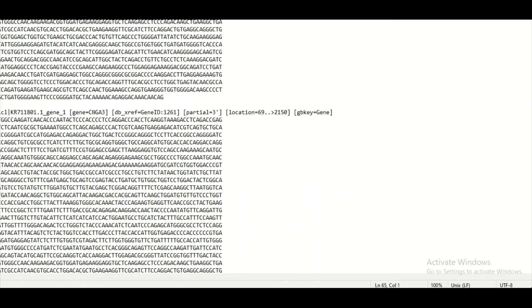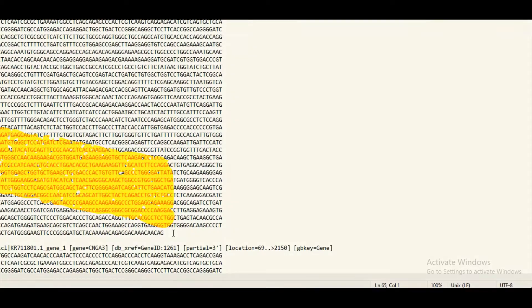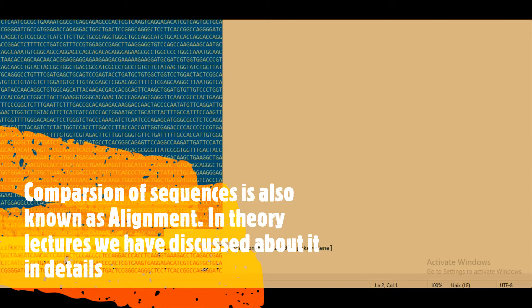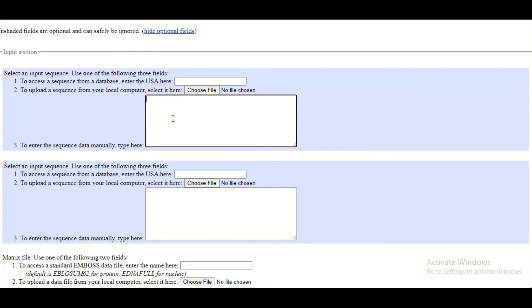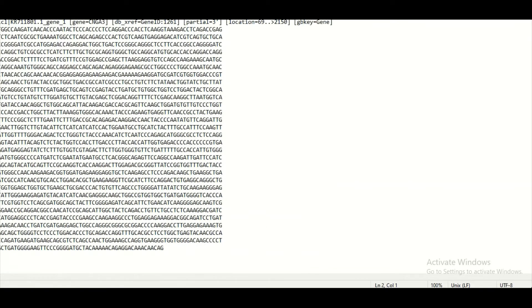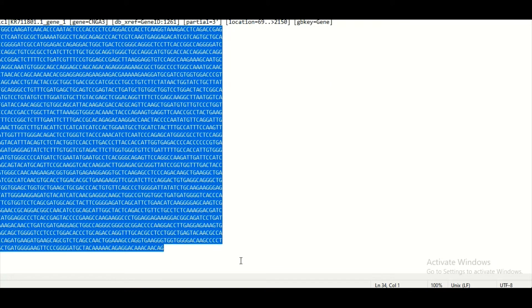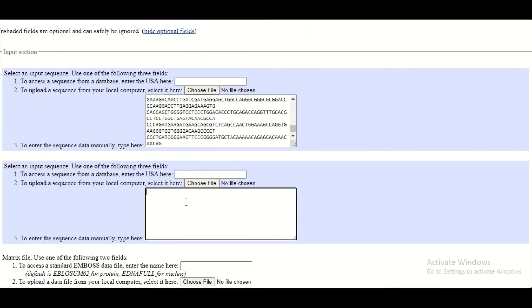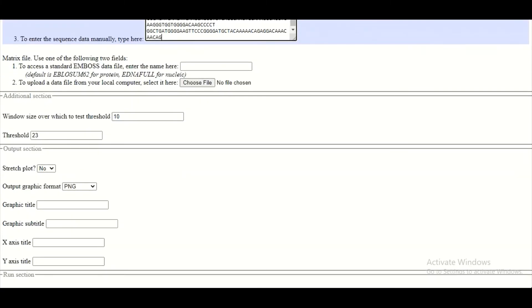Let's assume that these are the two sequences which we want to compare with one another, or in technical words, we want to align with one another. So what we will do is copy this first sequence and paste it here in this box, and the same thing we are going to do for the second sequence — we will copy it and paste it into the box, then we will fill up the rest of the other information.